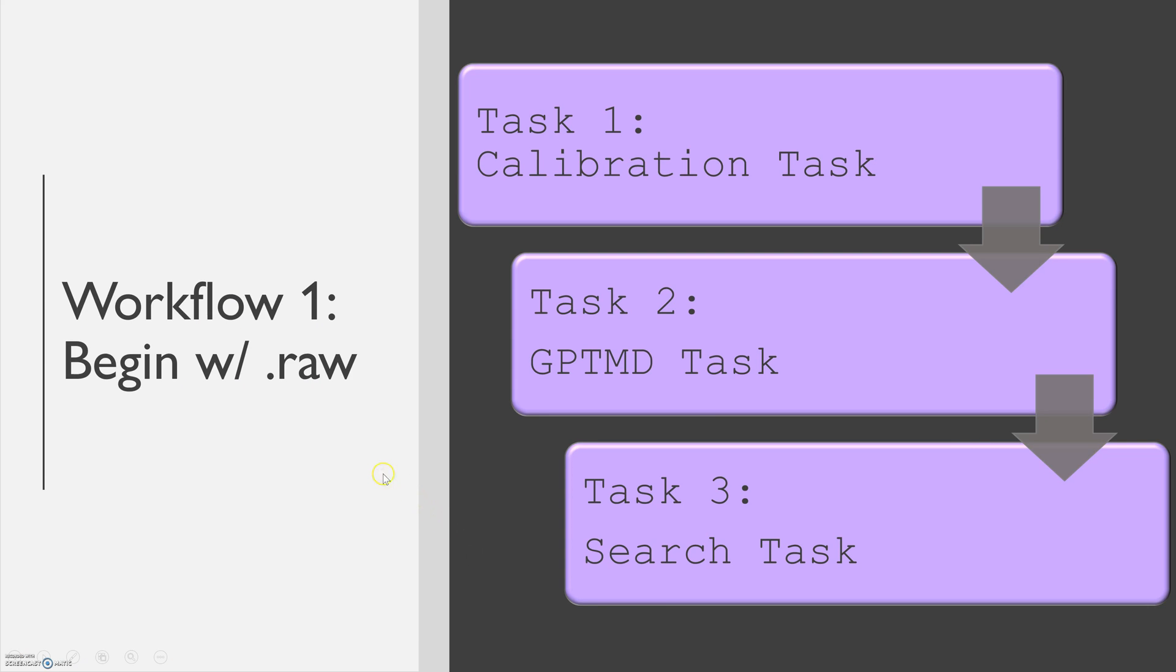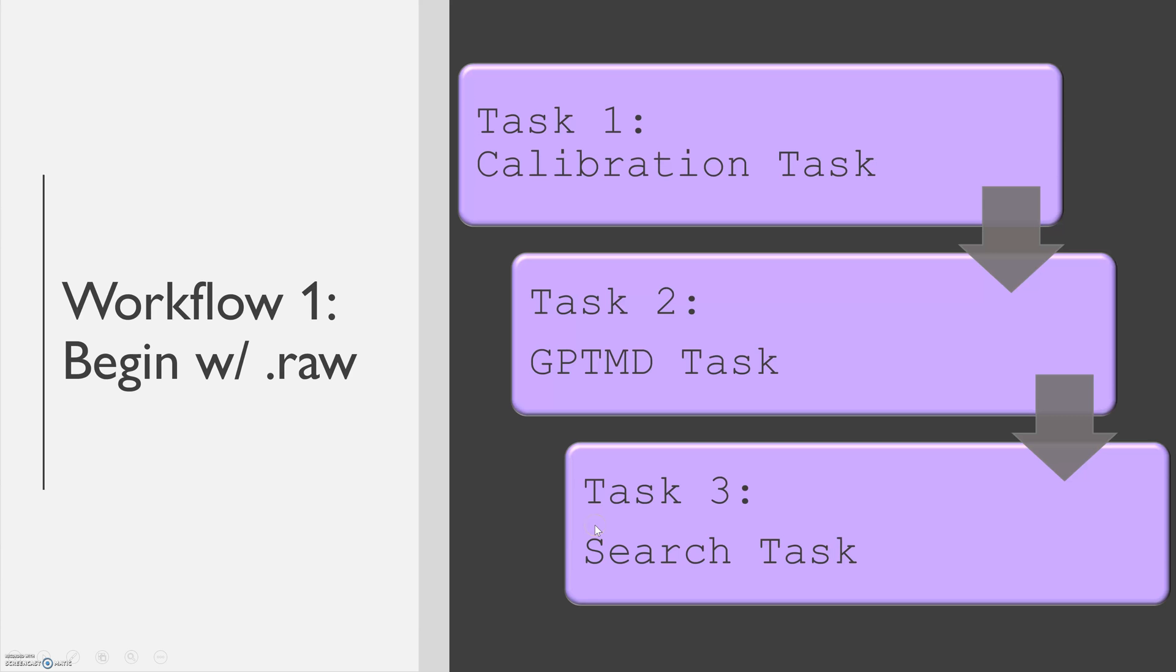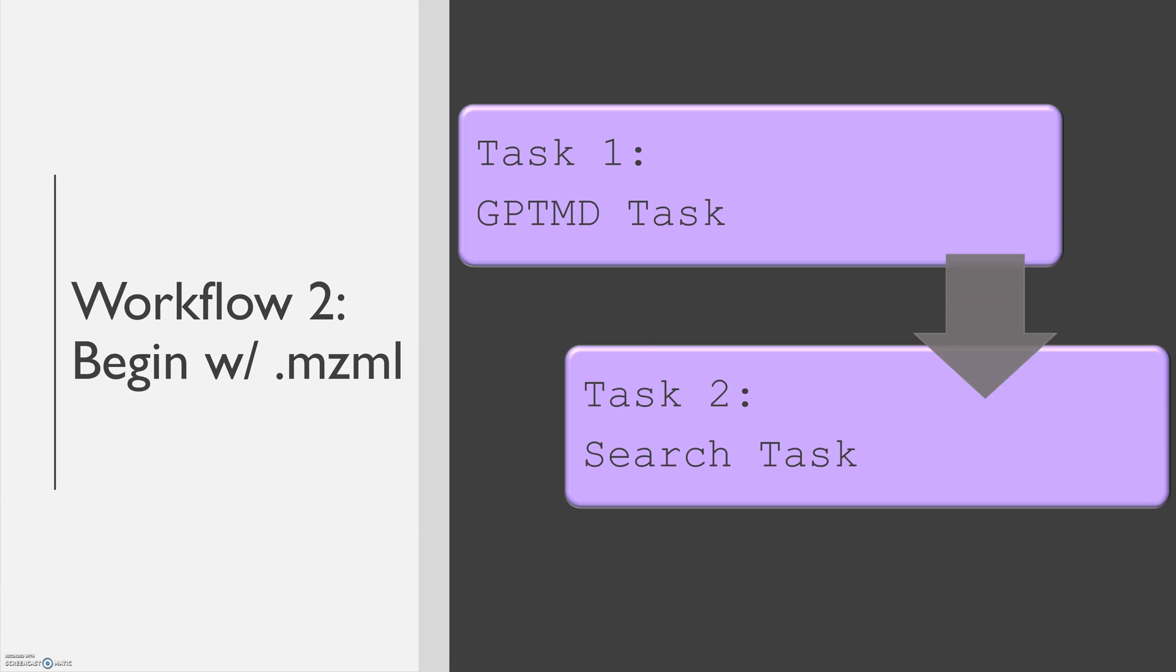So what are conventional workflows? The first workflow will begin with a .raw thermo file. You're going to begin with a calibration task, followed by a GPTMD or Global Post-Translational Modification Discovery task. And finally, task three will be your search task. The second typical workflow will begin with a .mzml file or a previously calibrated spectra file. And here, you do not need to perform calibration again. You begin with task one as a GPTMD task and task two as a search task.